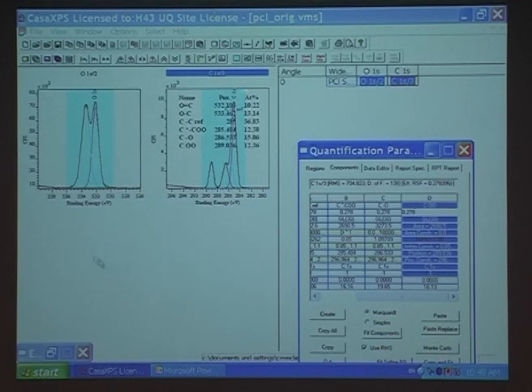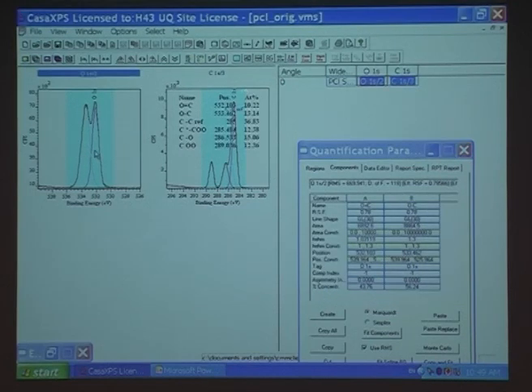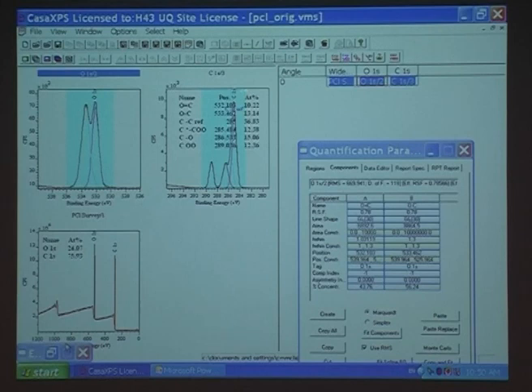And now, these should be in the ratio one to one to one to one to three. Well, it's not too bad. There's one. This has gone a little high. I don't know why. That's nearly one. This one's a little less. But in general, it's pretty close to one to one to three to one to one to one. Because if you look at the structure, there'll be one of those, one of those. And when you've got these numbers pretty close, you're then fairly confident you've done the fitting right. This is a very simple case, and it's coming out. Then I finally put on here, in the same thing, here's the survey, and that's that data finished.